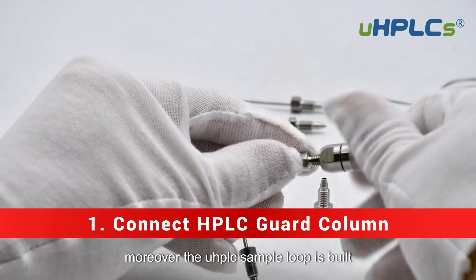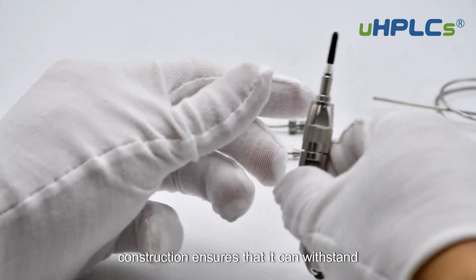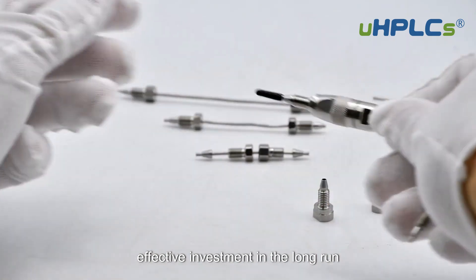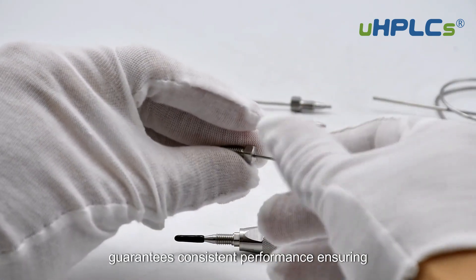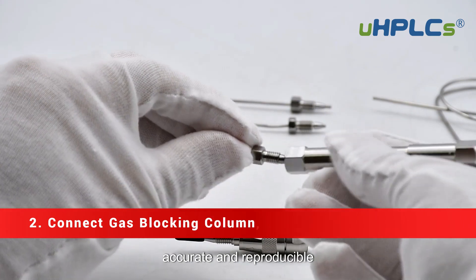Moreover, the UHPLC Sample Loop is built with durability and reliability in mind. Its robust construction ensures that it can withstand the rigours of daily use, making it a cost-effective investment in the long run. The precision engineering of the loop guarantees consistent performance, ensuring that your chromatographic analyses are accurate and reproducible.